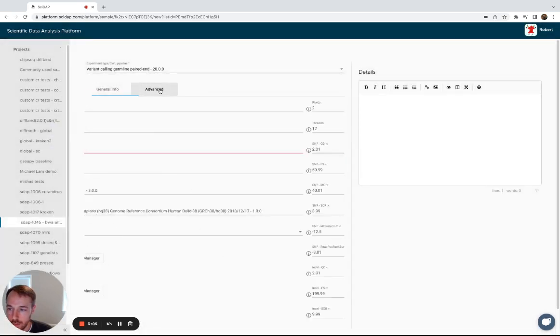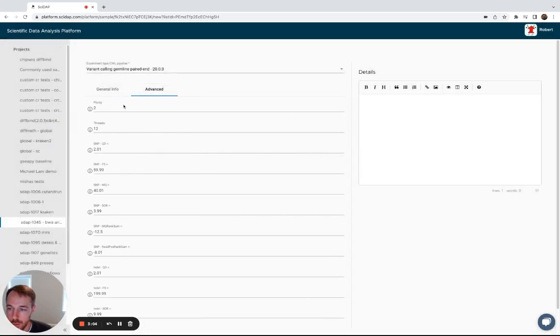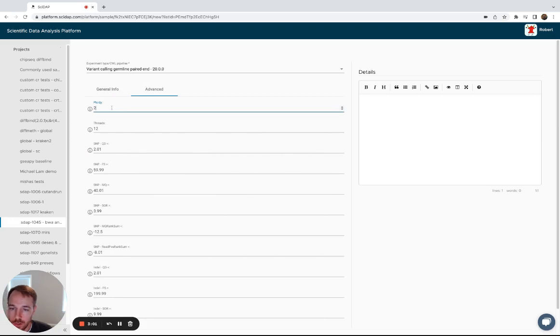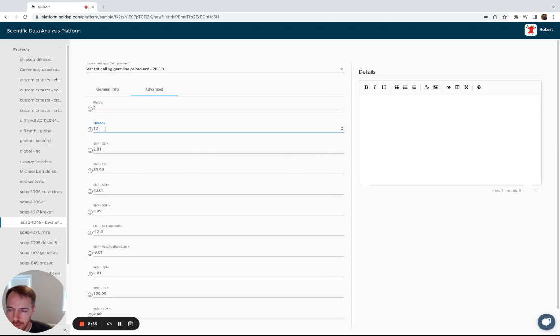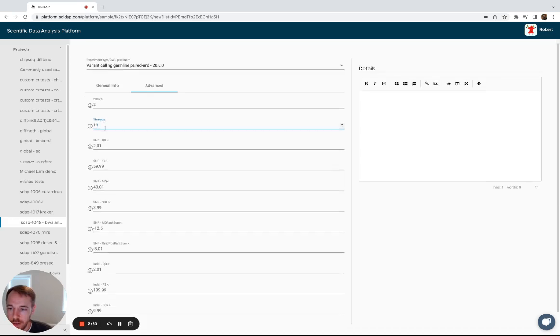Then for advanced parameters, you can change the ploidy of the organism you're working with, but that will generally be two for humans and other animals. The threads, particularly for genome alignment, this will depend on the hardware of your satellite.